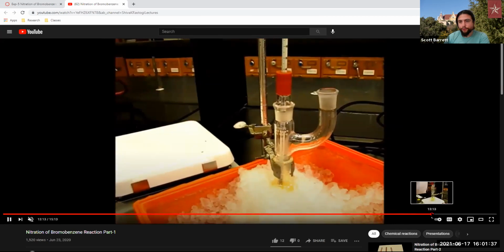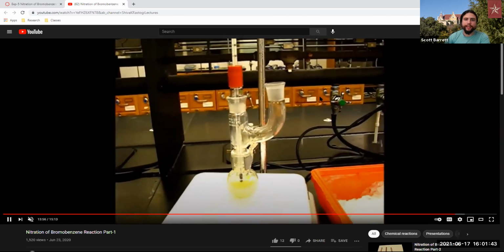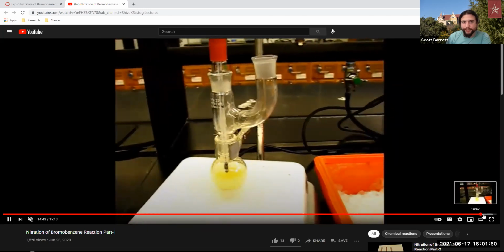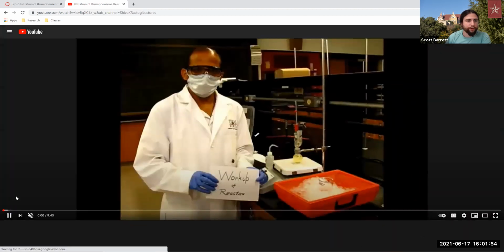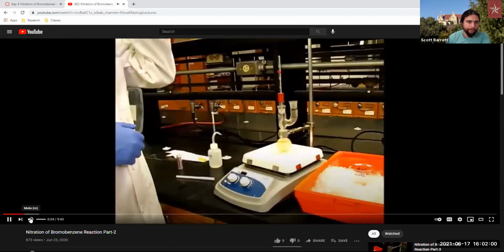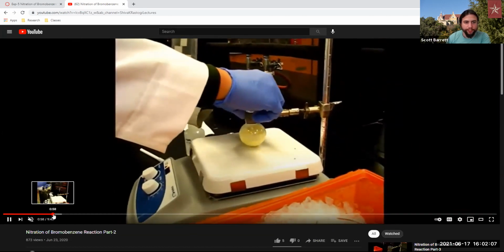Okay, so we're going forward, skipping over here. And I believe that they might have cooled it down there because they were trying to control the temperature, make sure it didn't boil too hot, because it does get hot. So we want to hold it back. So here's part 2. We finally have finished our reaction. And you could listen to the audio separately because I'm kind of just skipping through here so that everyone can see what we're tackling.